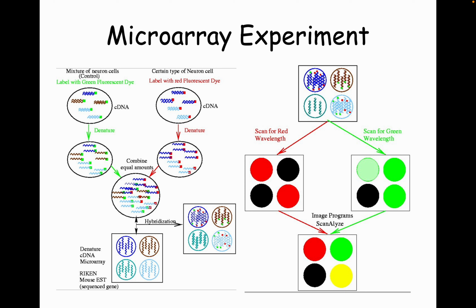It's very easy to translate these and glue them down to a grid. And then, of course, you just wash your antibody over, maybe even fluorescently label your antibody, and you can tell exactly where your antibody binds and where your antibody does not bind. And in that way, you can tell what's the specificity of your antibody. Which part of the protein is it binding? What exact sequence? Stuff like that.